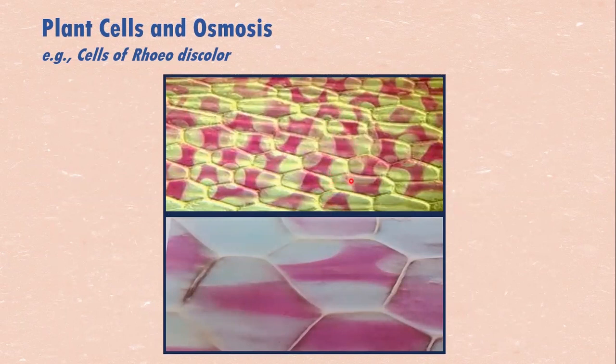These cells are plasmolysed. And these cells, if they are taken from the hypertonic solution and put into water quickly, the water molecules will move in and the cells will regain their turgidity. So plasmolysis can be reversed early if the cells are removed from the hypertonic solution and placed into water. Good. So we have two quick questions to solve.